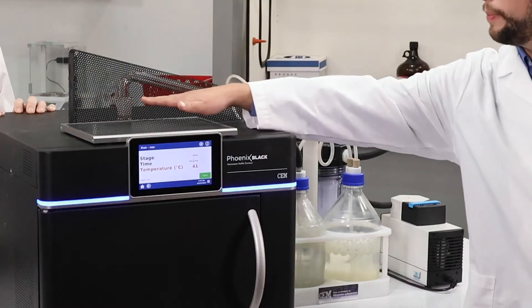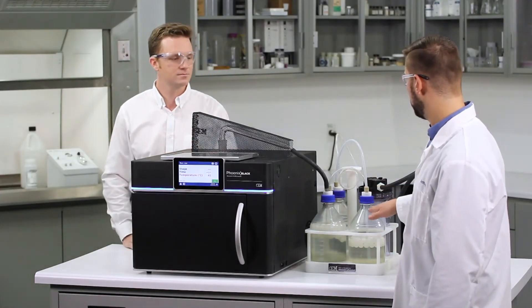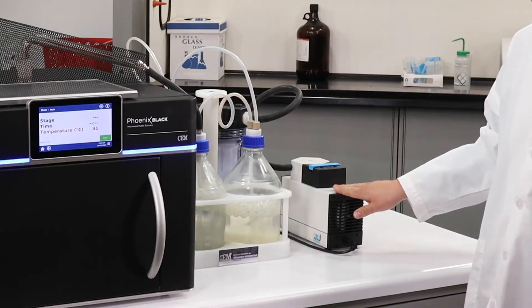The acid vapor will come through this quartz bridge into the scrubber system, which has sodium hydroxide, water, and an empty bottle, followed by a carbon filter to remove all of the vapor.